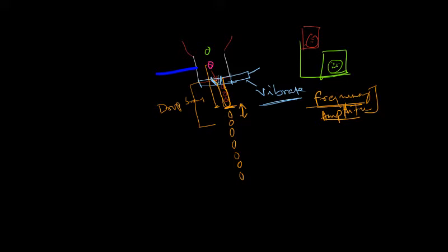As the cell is reaching the edge of the stream, since we are using a frequency and amplitude to control the break-off, this distance, from the sample detection to the edge of the stream, remains fixed. And this is called drop delay. That means how long it takes to break into drops.